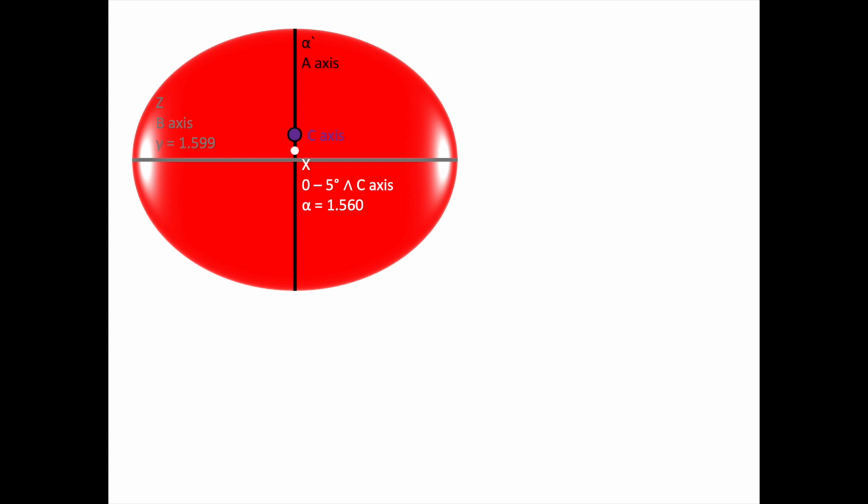Let's also take into consideration where our optic axes will be in this diagram, here represented by 2 stars. And further note that the interference figure that we generate with this view of our optical indicatrix is almost an acute bisectrix figure, or a BXA figure. Once again, we're 1 to 3 degrees away from this view, just depending on how far we've actually rotated our optical indicatrix.